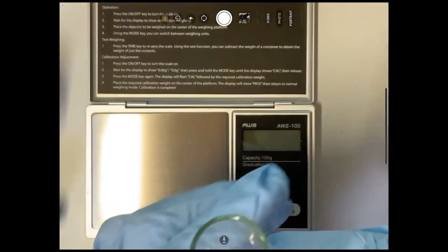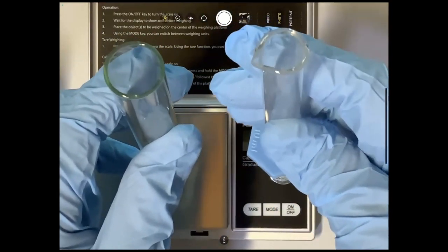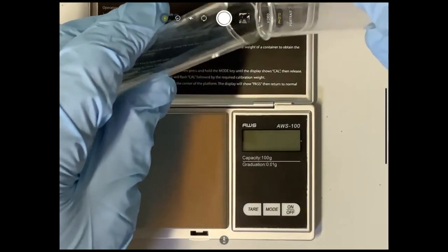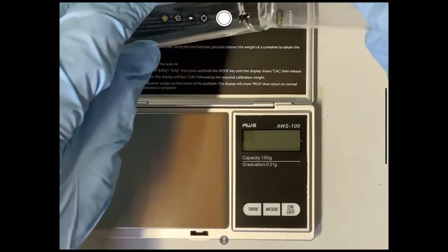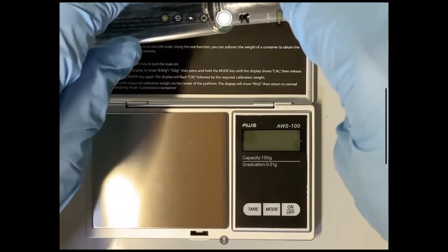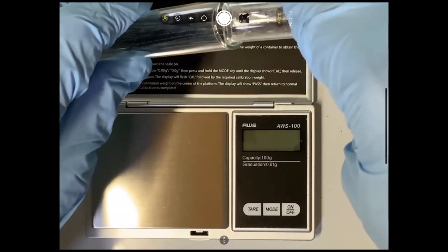So I'm just going to take this, okay, I hope you can see that, and I'm going to pour it so that it rolls down the side. I don't just want to pour it in and splash it. I want to roll it down the side so that it doesn't mix. Okay, I'm just going to pour it so that it rolls down the side so it doesn't mix.